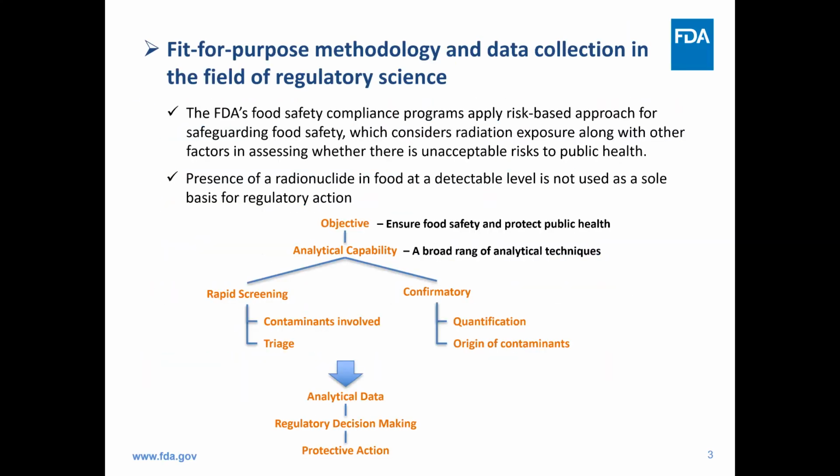In the US, the risk-based approach is applied for safeguarding food safety, which considers the radiation exposure along with other factors to assess whether there is an unacceptable risk to public health. Such an approach is data-driven and requires a broad range of analytical methodologies.